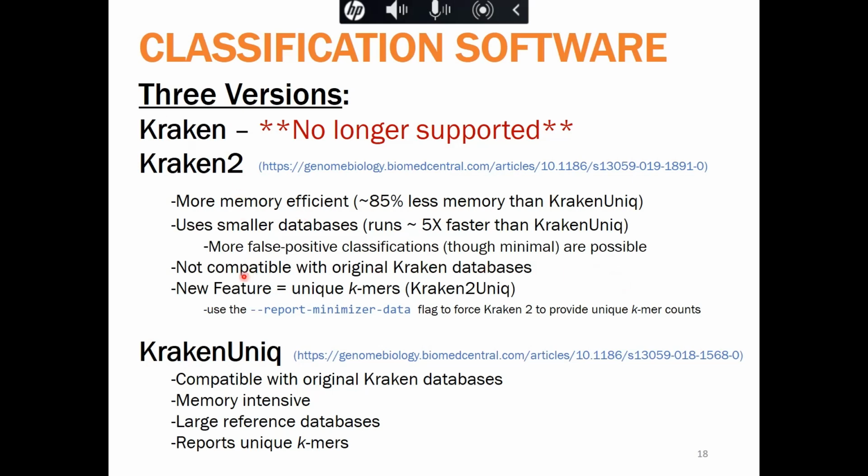Now, unfortunately, with Kraken 2, the original Kraken databases are not compatible. So if you choose to use Kraken 2, you will either have to use a pre-computed database or build your own.